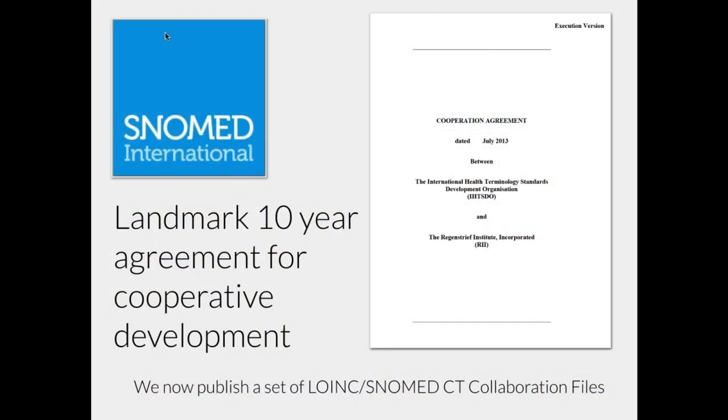In 2013, we embarked on the beginning of a journey with SNOMED, where we had a really landmark agreement for cooperative development, preceded by lots and lots of active discussions. Since then, actively working together, both organizations are publishing artifacts that contain connections between LOINC and SNOMED CT, and you'll find those both in the distribution of SNOMED and also in the LOINC distribution.